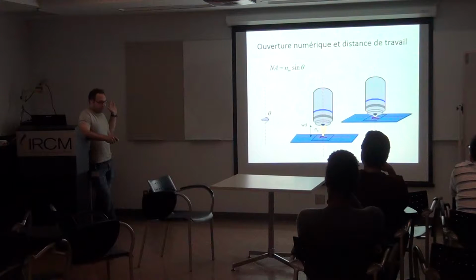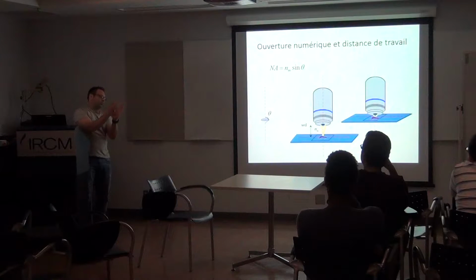Never. In this case, it's going to be between 0 and 1, depending on the angle. If the angle is 90 degrees, then it's 1. If the angle gets around half, it's going to be about the square root of 2 over 2, and so on.